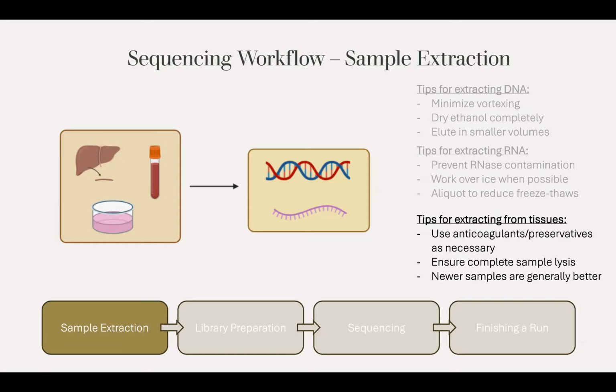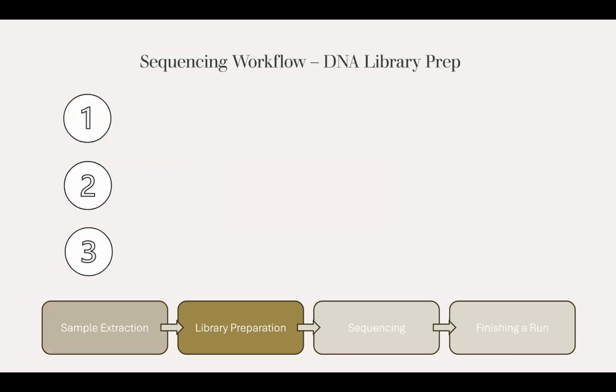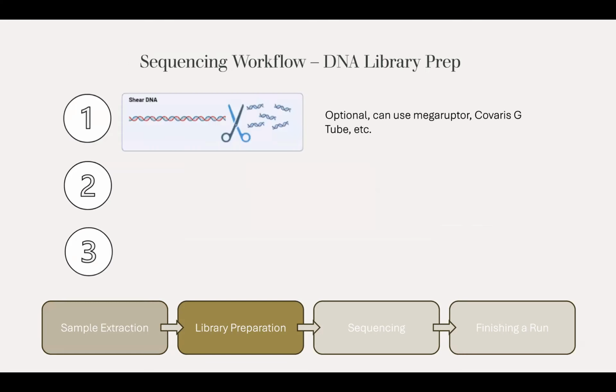Although if stored properly, you can probably keep some in the freezer for a while. But trying to extract from really old samples is generally not as good of an idea as extracting from newer samples. Okay, with that, let's discuss the DNA library prep protocol that I previously introduced.